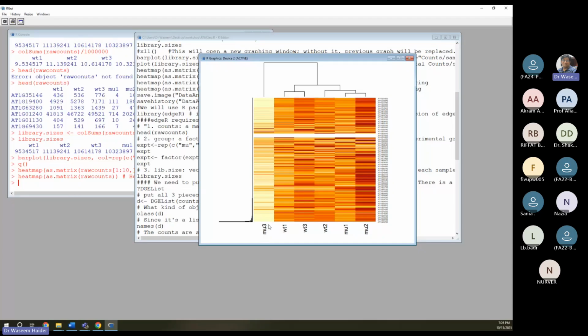So sometimes what we do is we discard the sample that is not at its right place. But here again, we have only 3 samples, so we will retain them. In my real experiment, I have like 200 samples. At one place, we actually discarded, I guess, 27 to 28 samples because of that. Because you are applying a treatment, but there is some possibility of variation within the experiment.